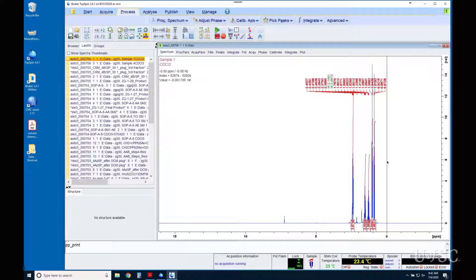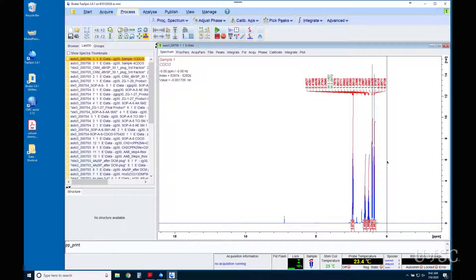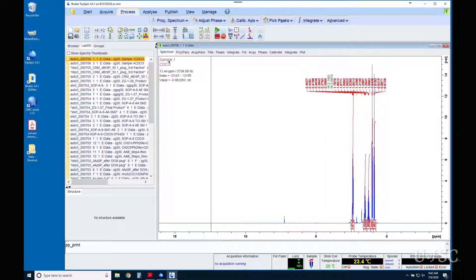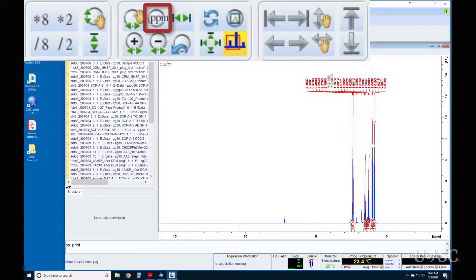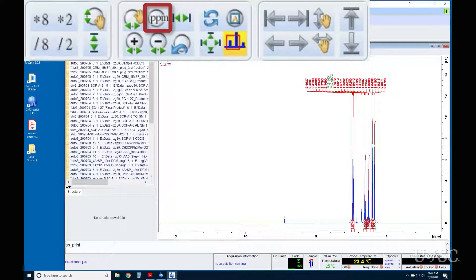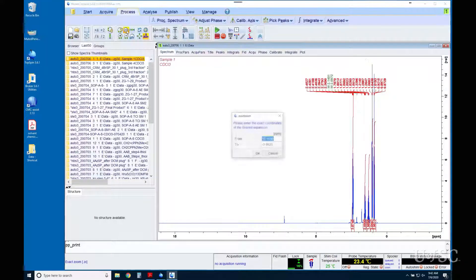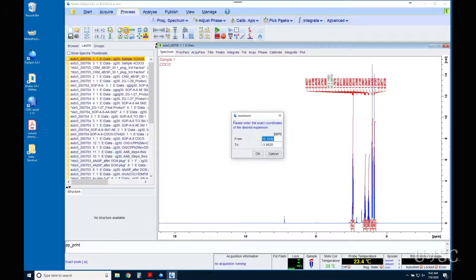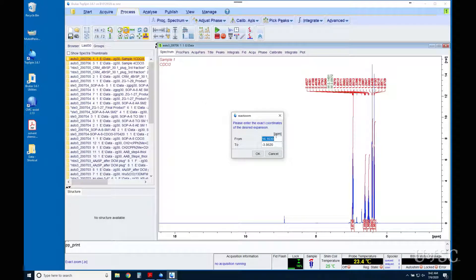The first step in plotting is to define the chemical shift region you want to plot. It is much easier to do this in the data window than in the plot editor. The exact zoom button is the best way to expand the region. Click on the button and enter the range you want.